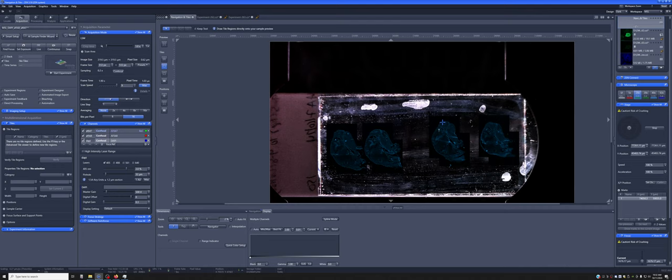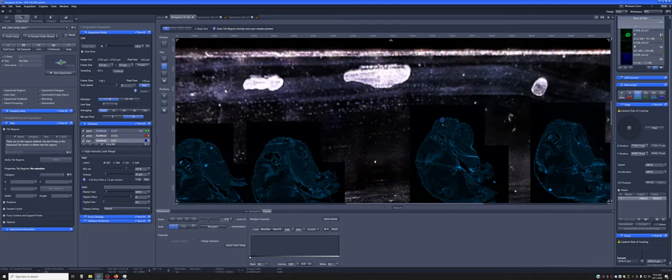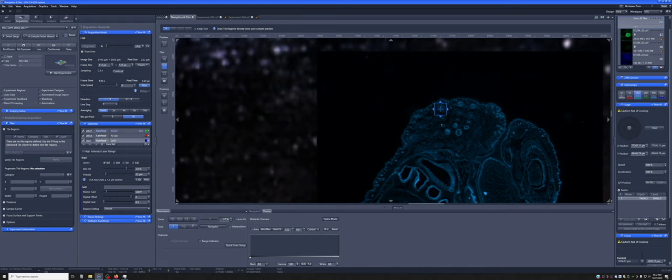So what do I mean by tiling and stitching? Tiling means acquiring multiple images next to each other so that they cover a larger area than what's possible with a single image. ZenBlue, this software, has multiple ways of generating tile objects.